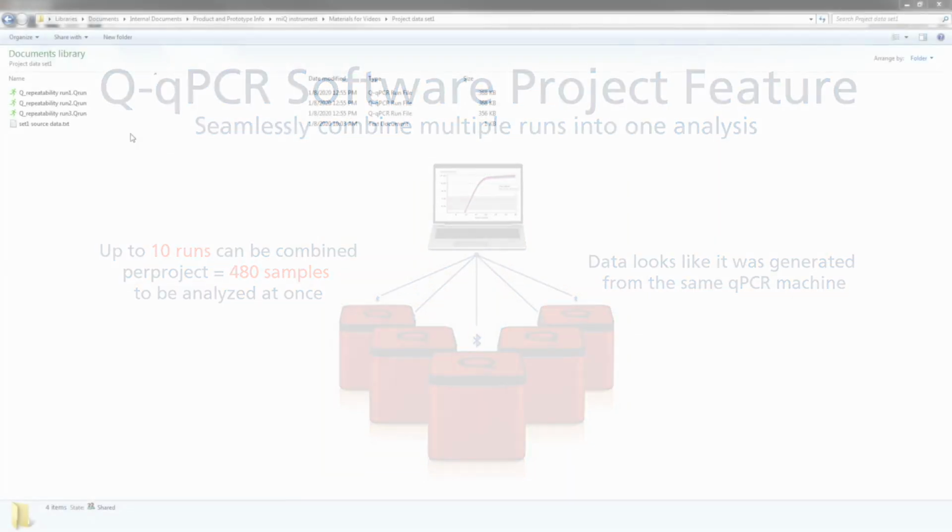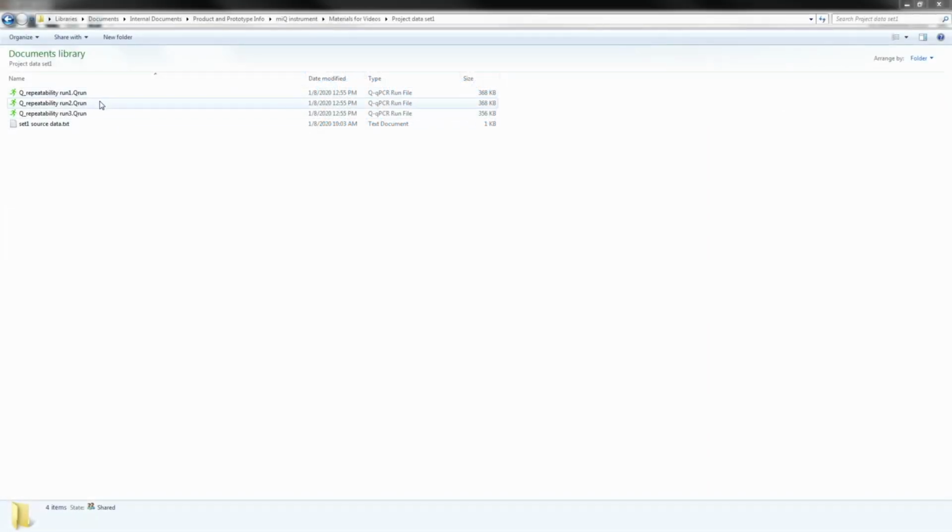The first example I will show is data from 3 distinct Q runs using the same samples. That is, each run included multiple replicates of an NGS library dilution, as well as 6 DNA standards of known size and sequence for absolute quantification analysis.